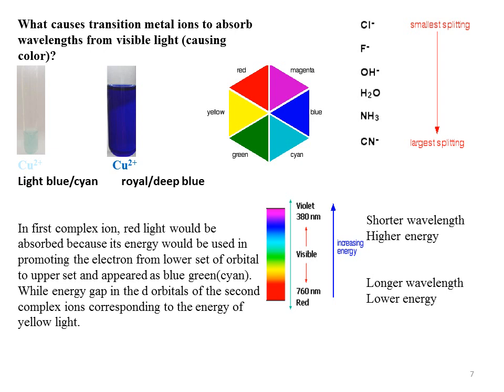So water in the first compound जो कि light blue या cyan color का है, water is acting as a ligand here. Water is a weak field ligand. In the second compound that is of royal blue or deep blue in color, ammonia is the ligand. Water weak field ligand, ammonia is the strong field ligand. So ammonia can replace the water in this. जैसे ही वाटर रिप्लेस होंगे और अमोनिया ऐड होगा, लाइट ब्लू से हमारे पास डीप ब्लू कलर आ जाएगा. ये तो अमोनिया और वाटर डिस्प्लेसमेंट की बात हो गई.